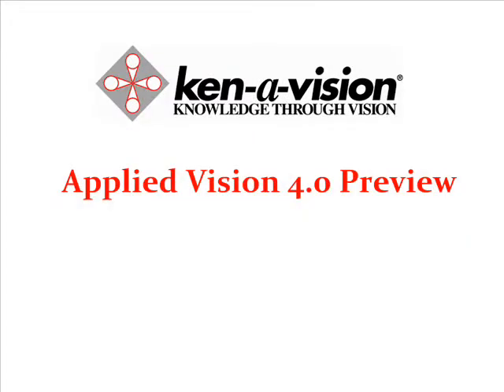Applied Vision 4 is a new cross-platform video capture application from Ken-A-Vision, incorporating a variety of new features for use with Ken-A-Vision cameras and digital microscopes. This video will demonstrate the new interface and a selection of features.